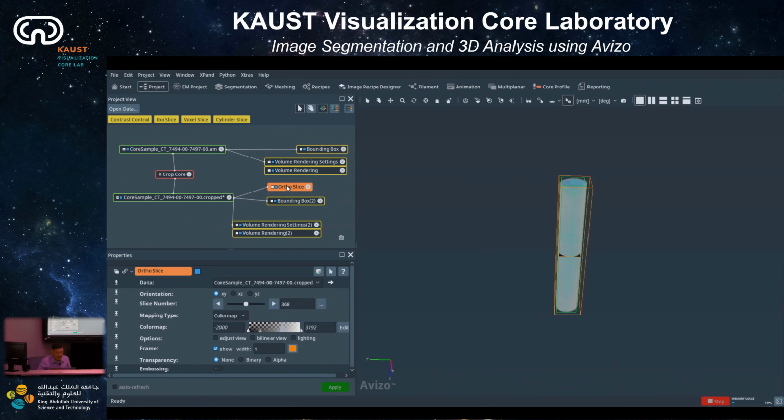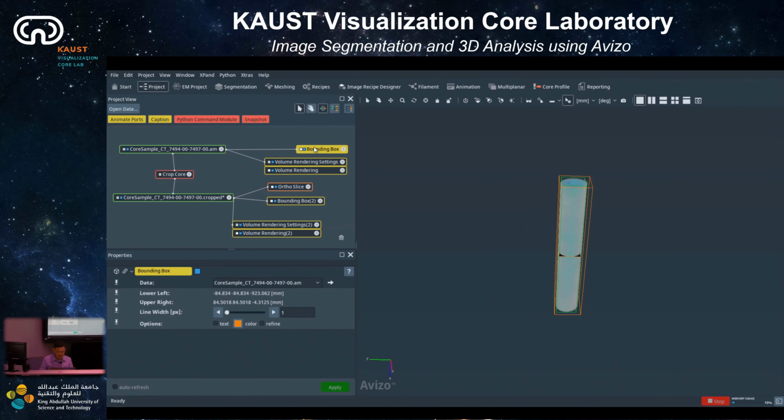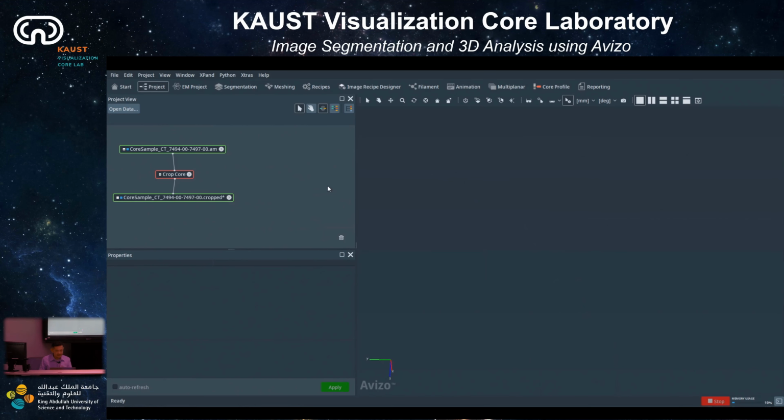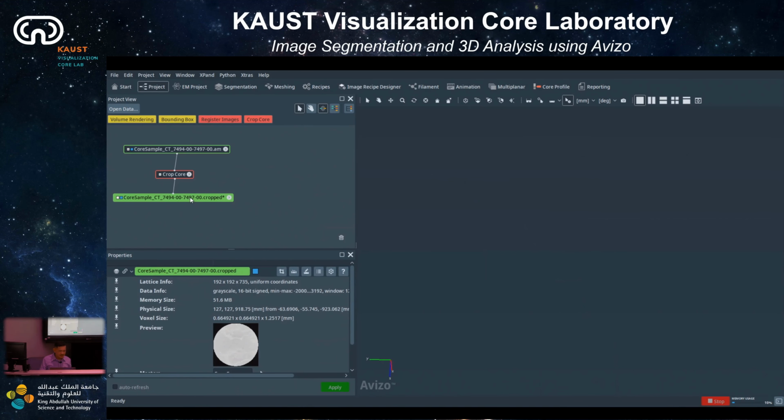Okay. And now we're gonna create some of the porosity. We want to see porosity fraction, and then later we're gonna create log and so on. So okay, I remove everything just to get you not too confused. So the first thing after the crop.